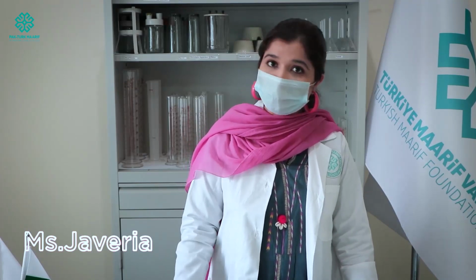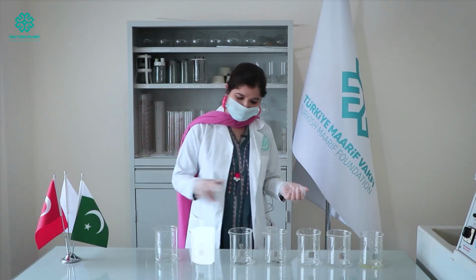Okay learners, now I will explain in detail what is the chemistry behind this magic. Actually, the beakers you can see in the line are filled with different chemicals. Yes, they are filled with different chemicals, but these chemicals are transparent and you cannot see them.